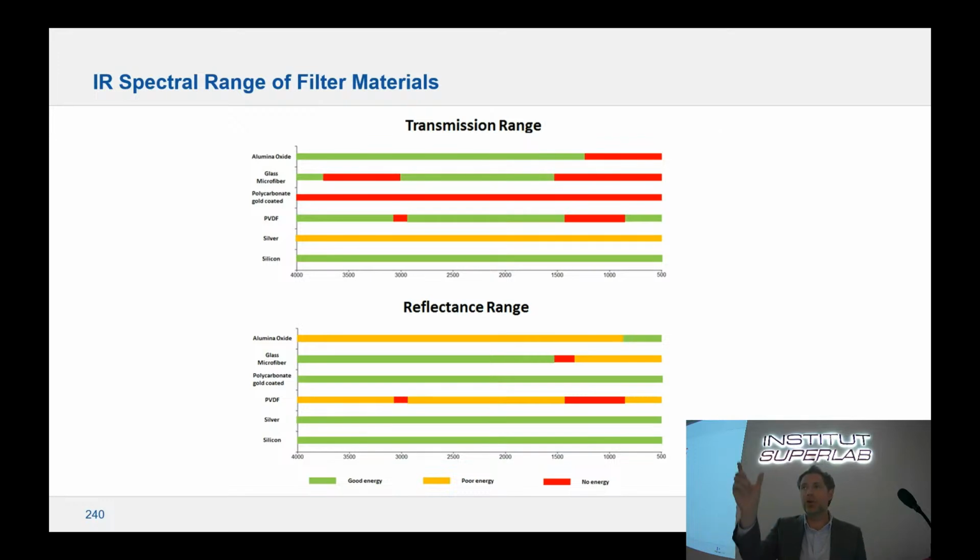You can see that if you focus on a small wavelength range, you can use that as well. So it's not an exact rule that you can't use any of these filters for certain types of analysis. Sometimes you can just narrow the wavelength range that you're looking at and still be able to do the analysis as well.